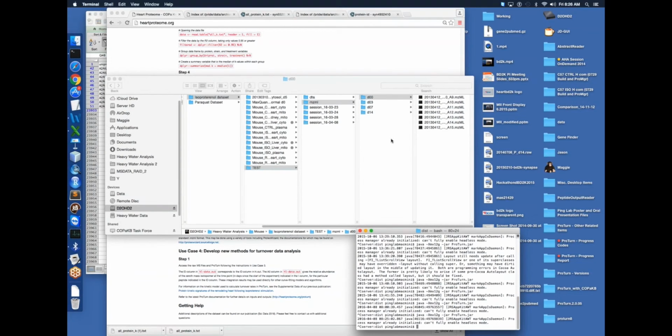Can I ask you a general question now while you're in the middle? Can you hear me? Yes, go ahead. So if a user or customer is trying to identify a specific data set, is the file descriptive enough, or does it need to download the metadata first? How does an outsider user approach asking a specific question and downloading the exact data that they will need?